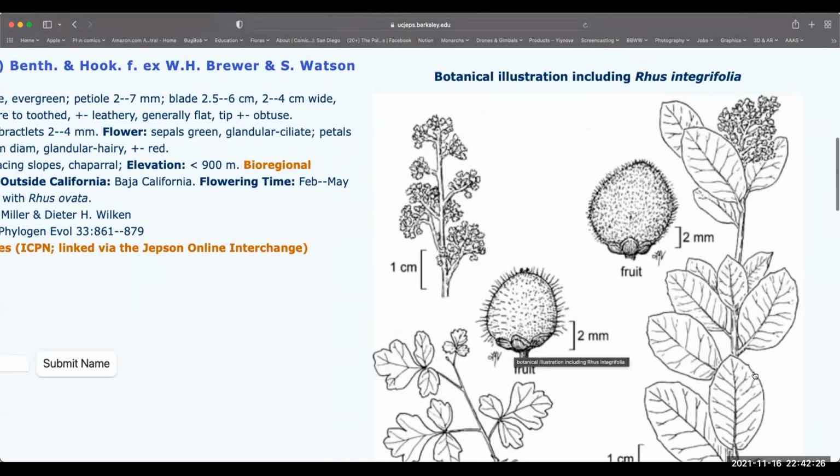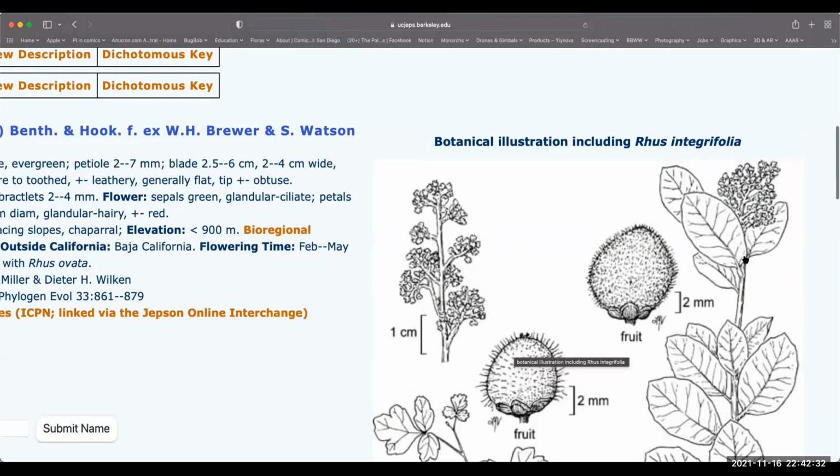And then draw at least one leaf for everything you do. So you can just pick one of these leaves. Like, look at that one way up there. Try to draw a little bit of the stem. That's always very helpful to make a leaf look more realistic. And then draw that leaf. And there's its veins too. It's a really easy leaf to draw. Sketch that on your lab page, not the book. And now you've got 2 of them done.